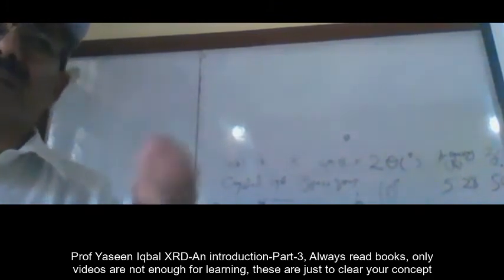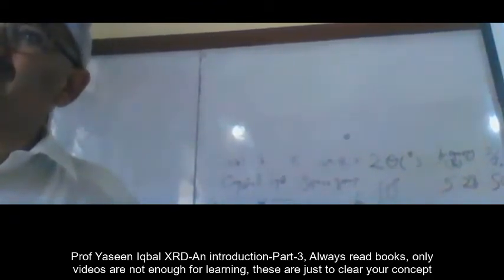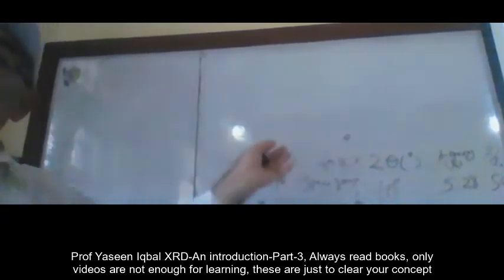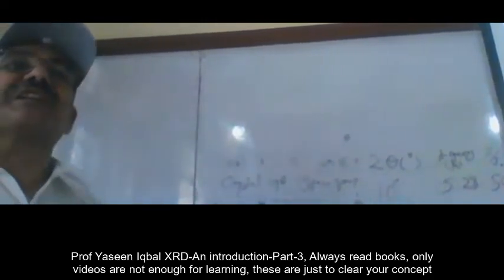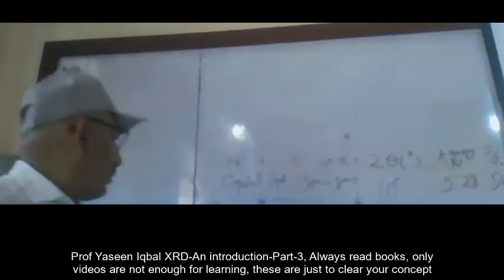So when the pattern appears like that, this means there is something else. And don't ignore it. Maybe you are missing the most important result you have got during your research. So never ignore these things.